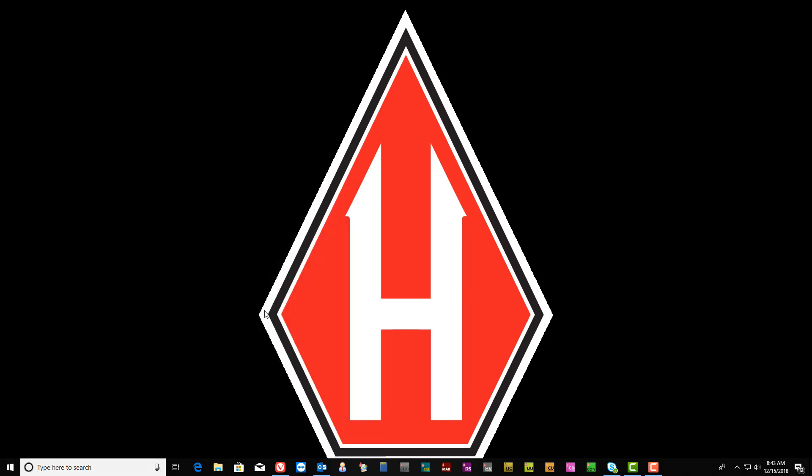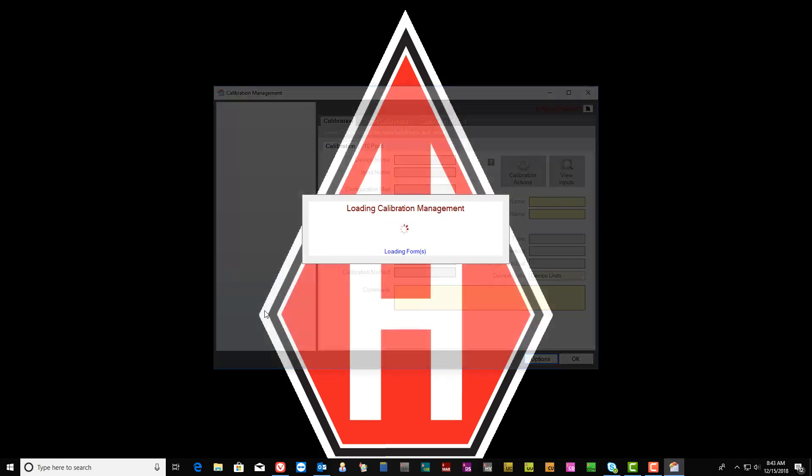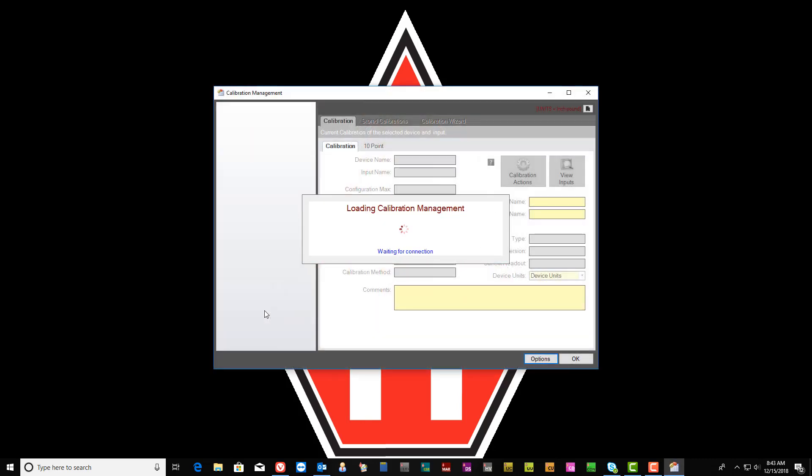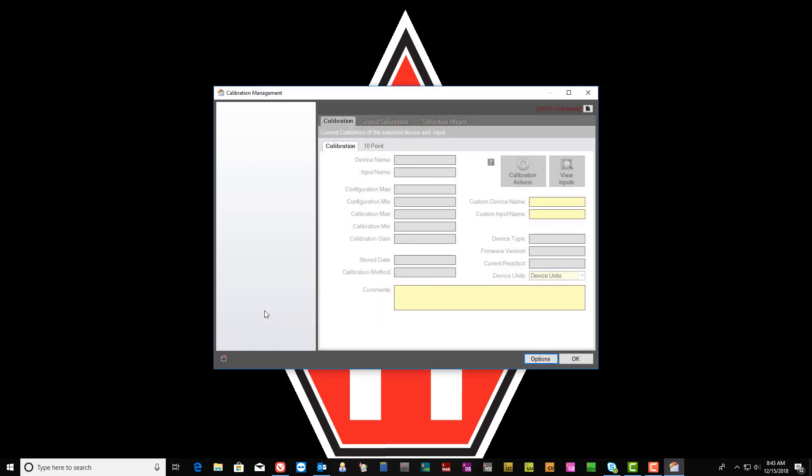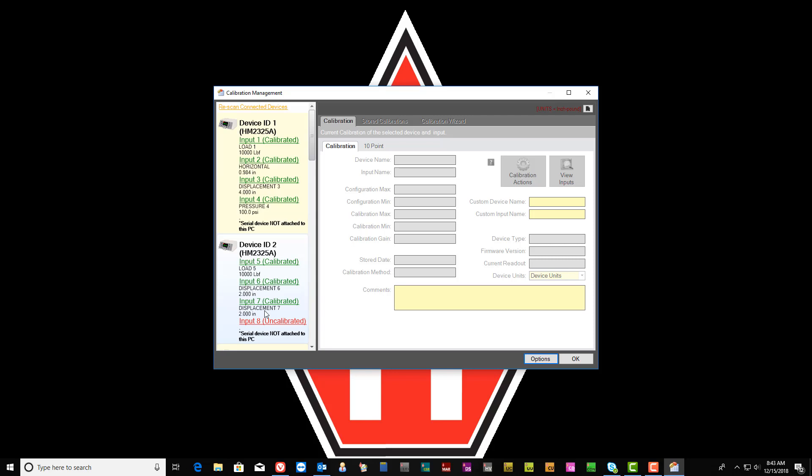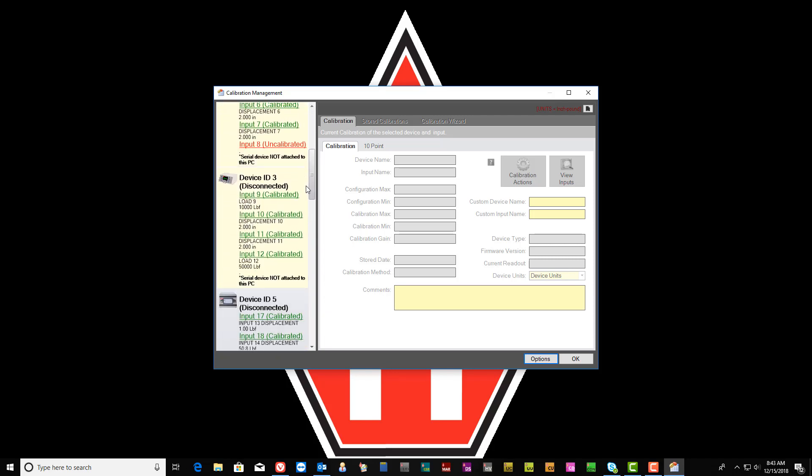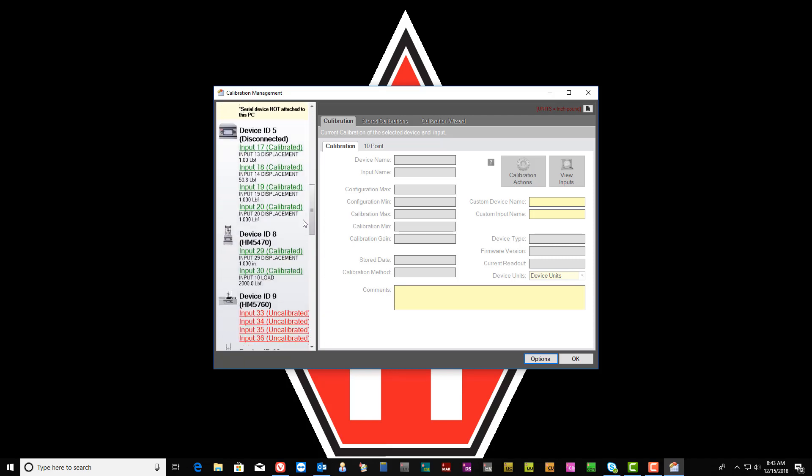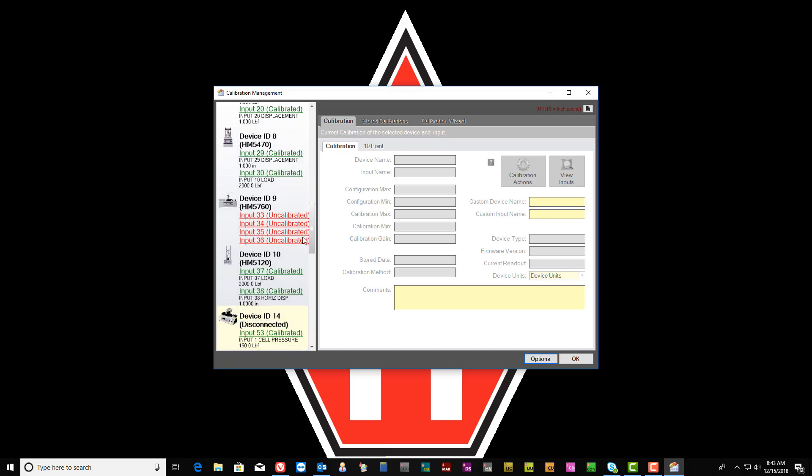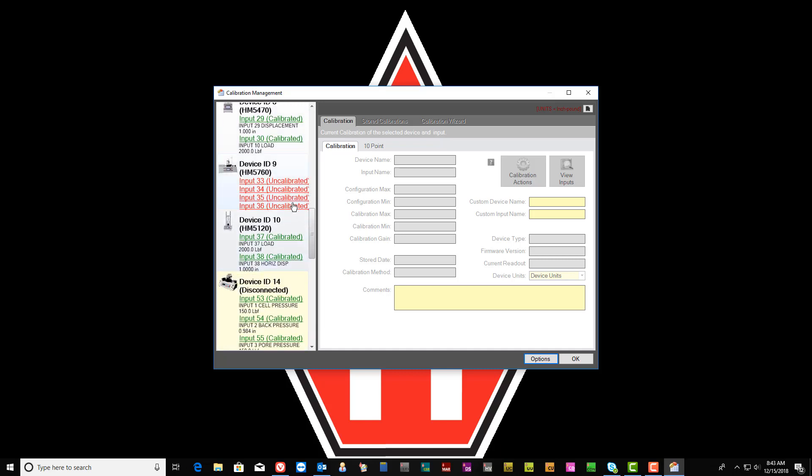Once selected, the Calibration Management pop-up window will appear. Once all the instrument data has appeared on the left of the screen, you can scroll down to the appropriate device that you wish to import the calibration data.